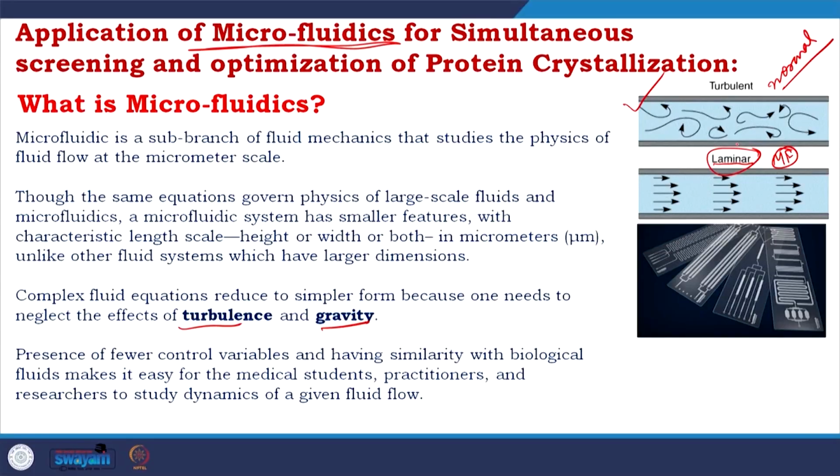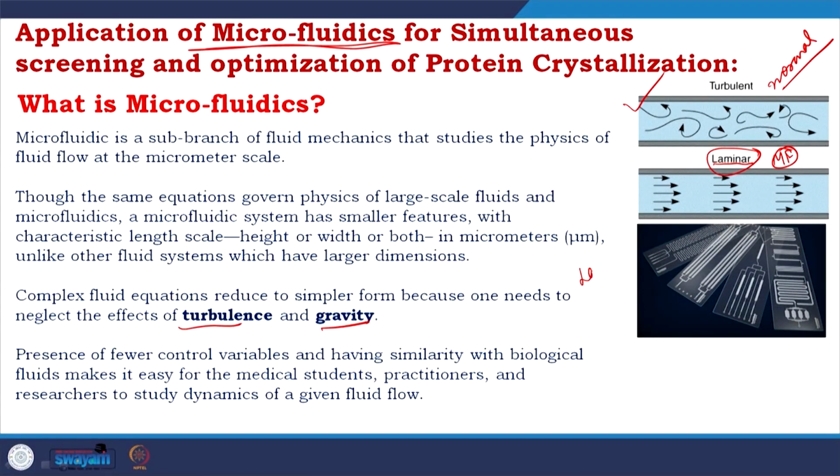Another thing is, when you introduce microfluidics, because of the small volumes, your instrument goes into a very small size, and it introduces something called lab on a chip. Lab on a chip, and you see these are the devices. You see the differentiation you could make in a small volume. Is it working? It is working, and it is revolutionary in biological diagnostics.